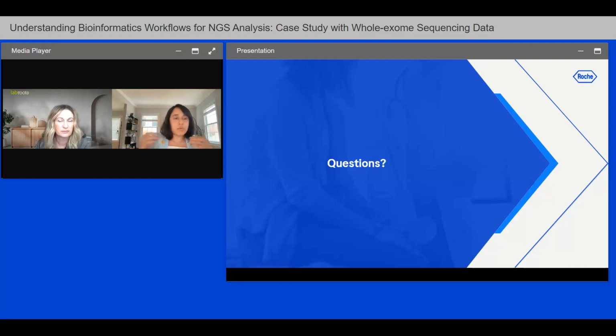If it's higher, we attribute it to off-targets, or there's not a uniform coverage in those target regions. I think that's how I can put it across. And that's why we look at a score which is closer to one, or even if it's 1.5, you pretty much say that it has uniform coverage of your reads over all the targeted regions.